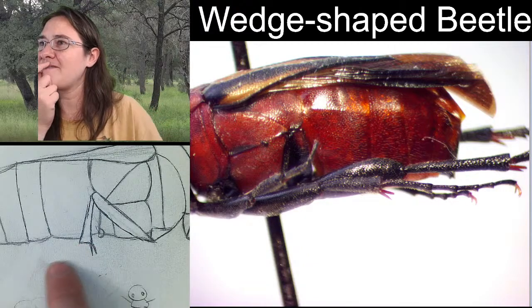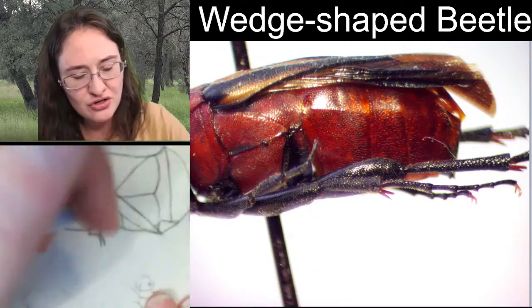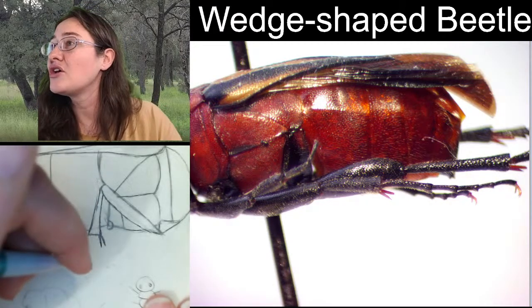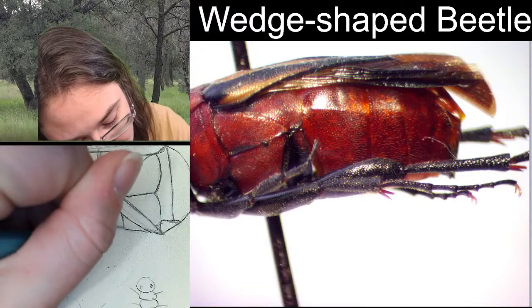All right, the five tarsal segments that are nice and narrow, these are toe segments. Let's see. 1, 2, 3, 4, 5. The first one is the longest.